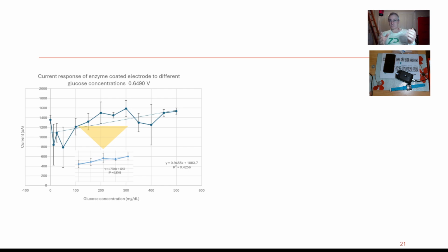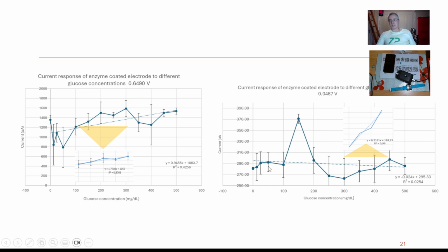So I'm going to show you some raw signal from Zimmer Peacock, and I'm going to say you need to generate raw signal that looks like this, then you can bring the microneedles back into this. I've got a horrible suspicion these microneedles are actually just corroding like crazy. But something's going on here.